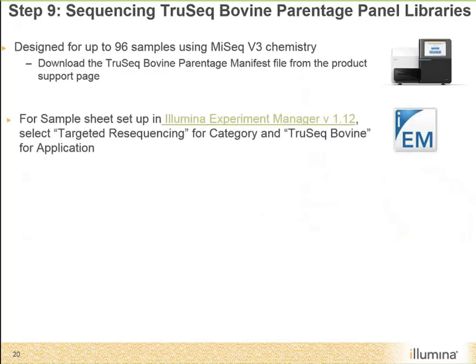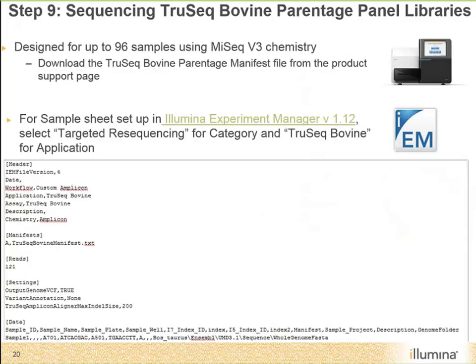An additional key piece of software that you will need is Illumina Experiment Manager version 1.12, which just came out recently, to set up your sample sheet using the TruSeq Bovine application within Illumina Experiment Manager.